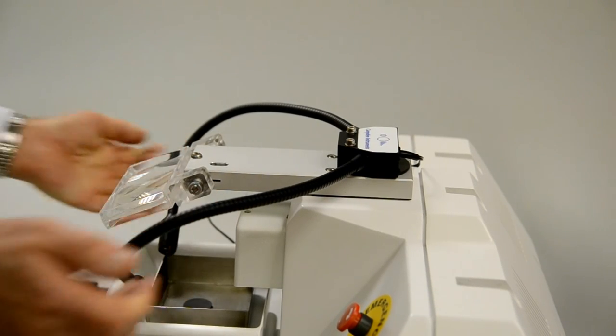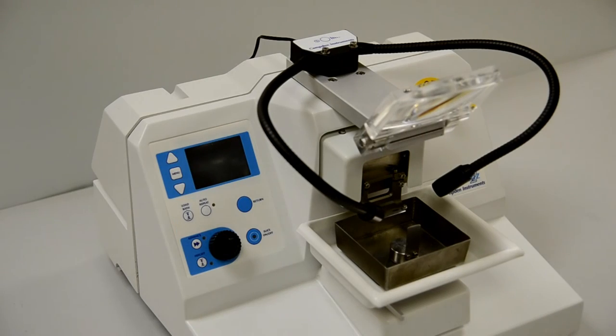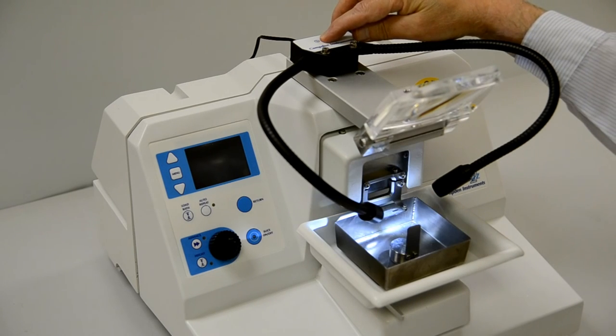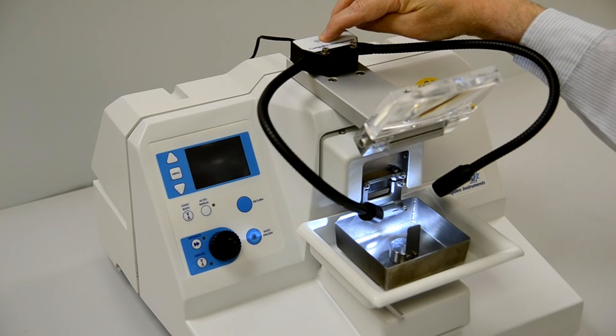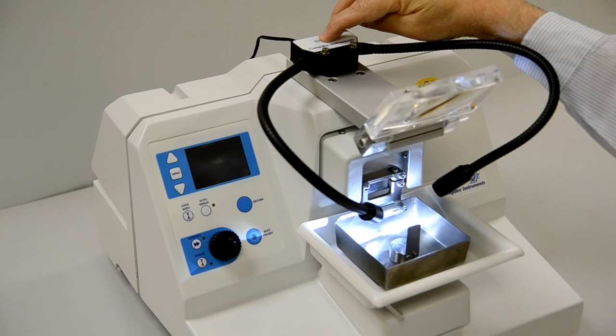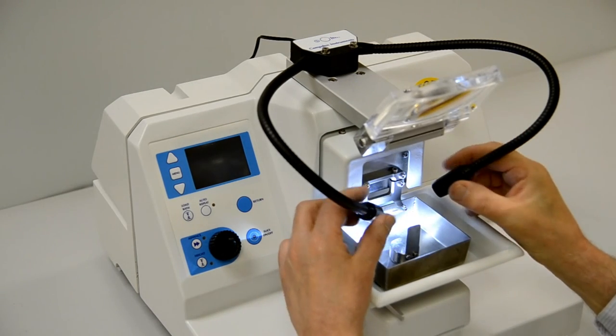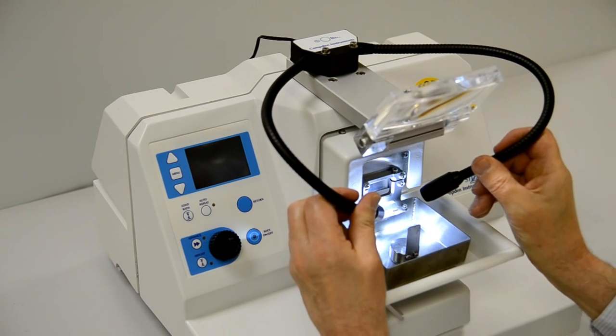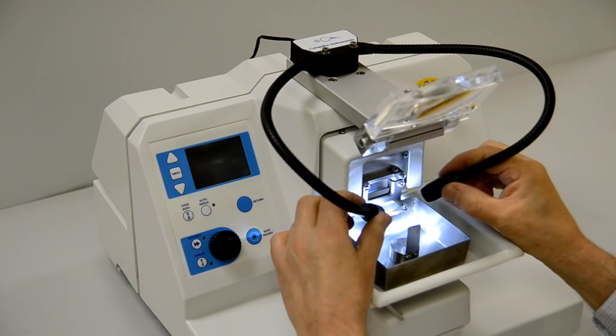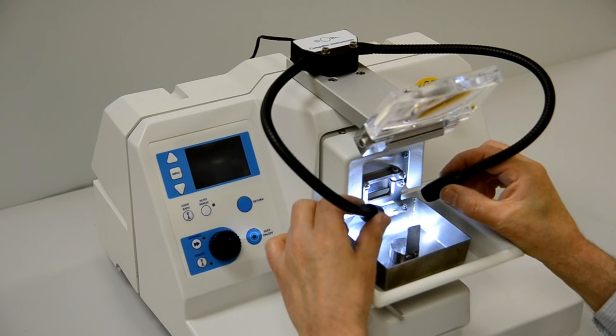The power supply is supplied with a number of adapters to suit most power outlets. The light intensity is adjustable. A press button on the mounting base controls both the intensity adjustment and the on-off functions. The light beams are focusable by twisting the ferrules at the arm ends.